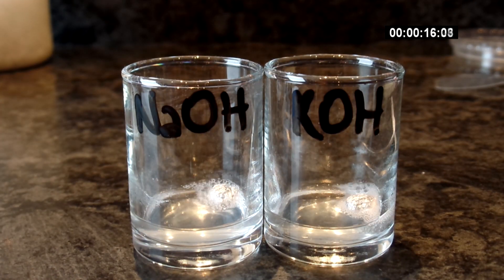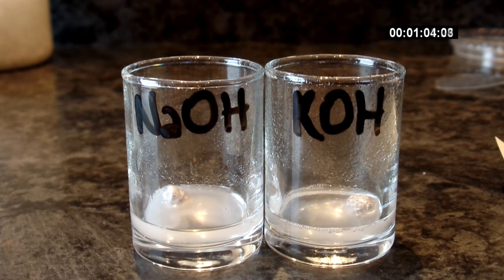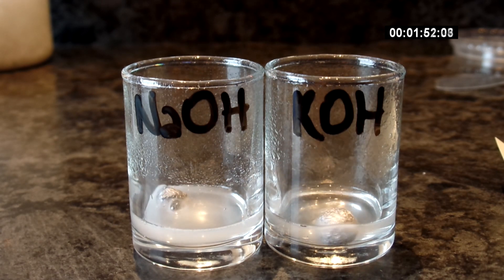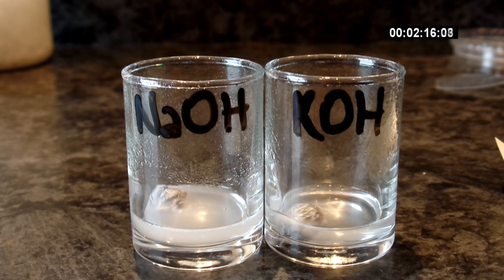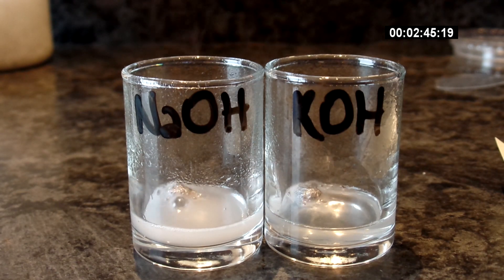I was now thinking that potassium hydroxide is much less reactive with aluminum, so I didn't expect to see a fast reaction — but I was surprised again. When used in the same molar ratios, both hydroxides behave very similarly.